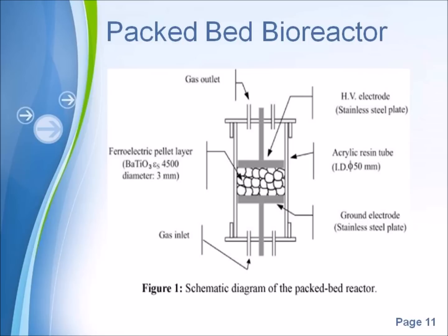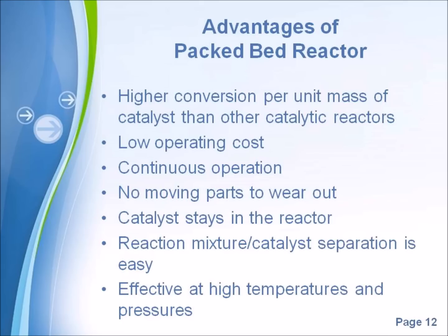These particles do not move with the liquid. Packed bed reactors are simple to construct and operate, but can suffer from blockages and from poor oxygen transfer. Advantages of packed bed bioreactor: higher conversion per unit mass of catalyst than other catalytic reactors. Low operating cost. Continuous operation.